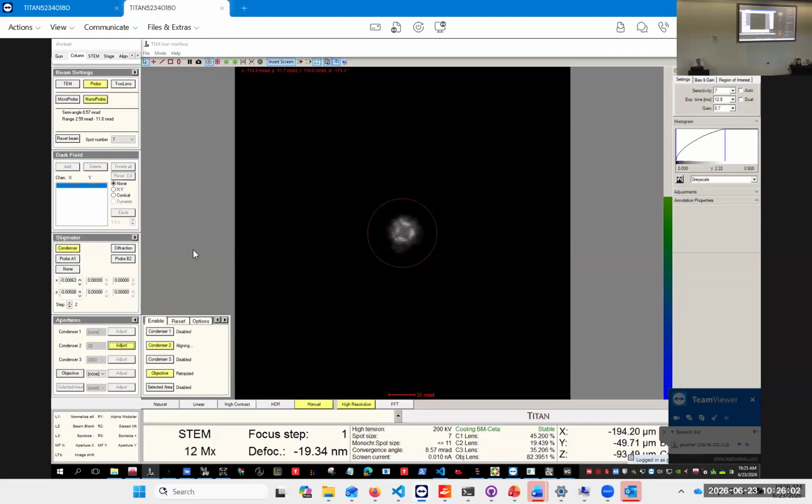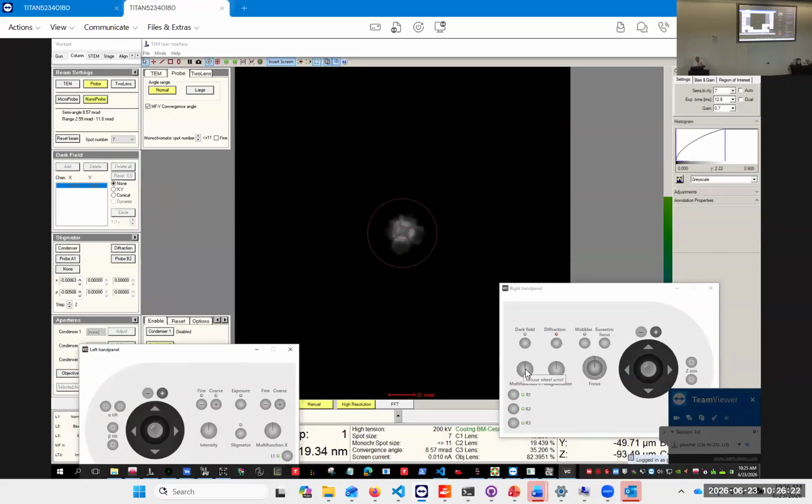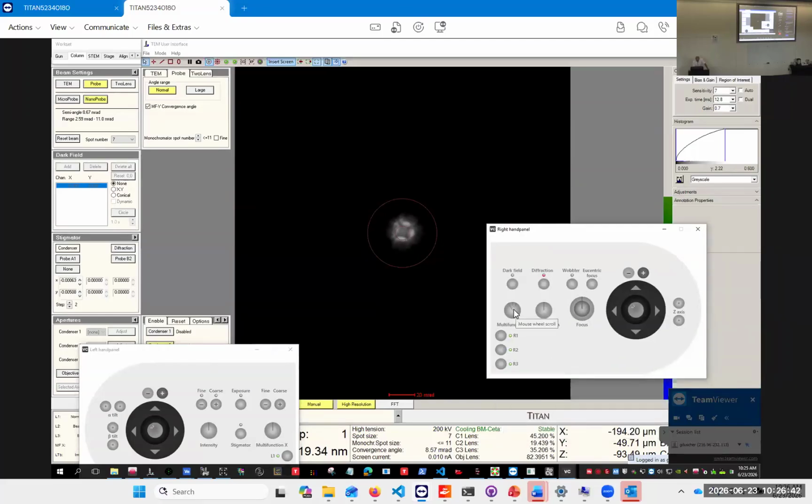Now let's leave that for the moment, because what we want to do now is make the convergence angle a little bit smaller. And yeah, I need my virtual control, because here I need my Y. So it says here Y angle is. So you see everything is all over the place. And we are looking down here on the bottom for this convergence angle, okay? And that just makes this convergence angle small.